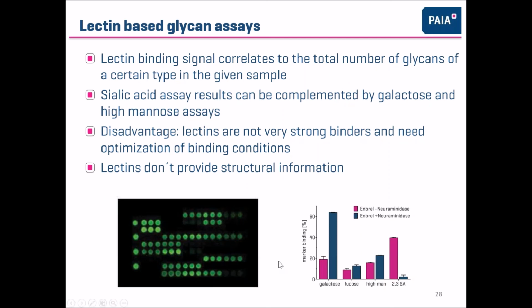So what you get with lectins are signals that indicate the presence of the different sugar residues on your glycoprotein.